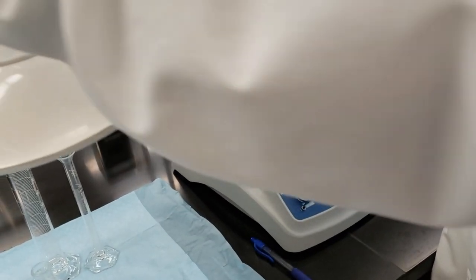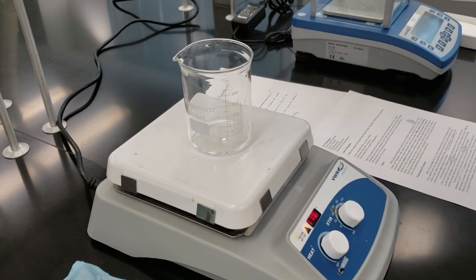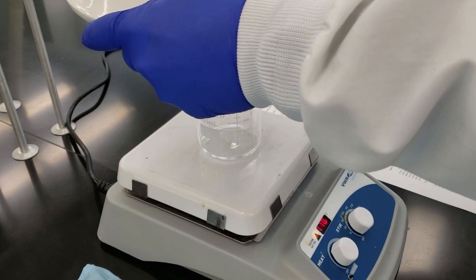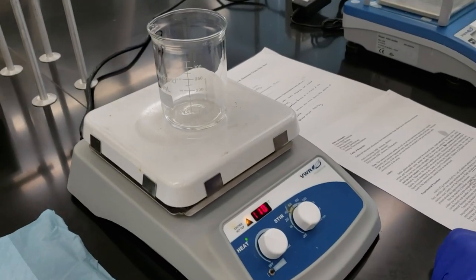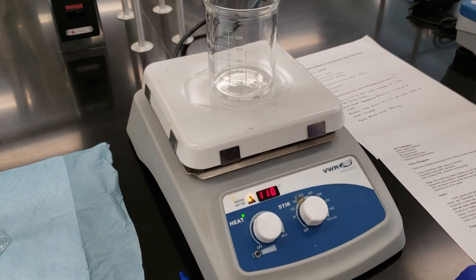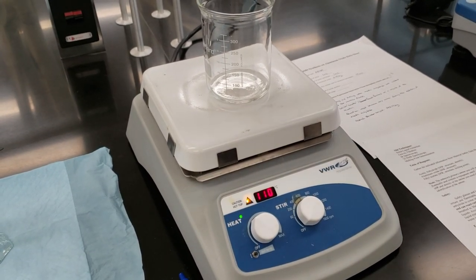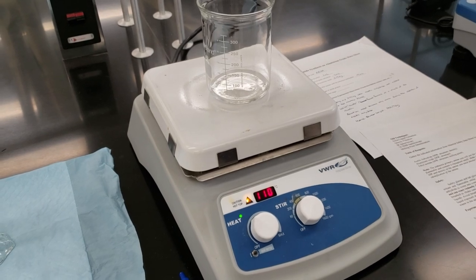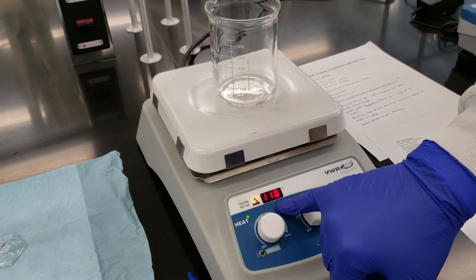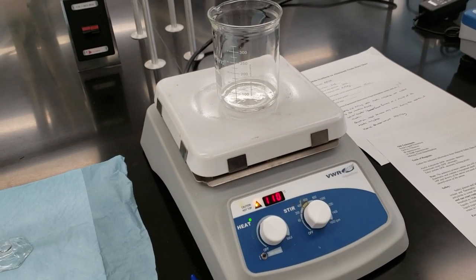I'm going to move my snorkel so that it's directly on top. Right now, we're going to be driving off our ethyl acetate to isolate our product as a solid. We're going to let this go for roughly 20 minutes or so. We'll give a specific recording of the time once it's finished. We've set our hot plate to 110 degrees as per the instructions in our procedure, and we'll check back in on it as it starts to evaporate.